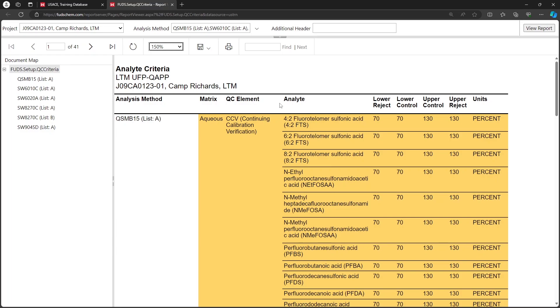Additionally, the limits listed on this report determine how the Automated Data Review will apply the flags listed in the QC Elements report, which we will look at later. In most cases, the default criteria come from the QSM. Values that were changed from the original template are highlighted, and mousing over a highlighted row will open a pop-up showing the original values for easy comparison.